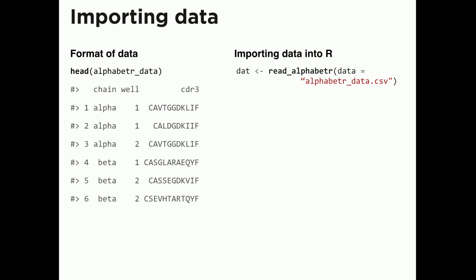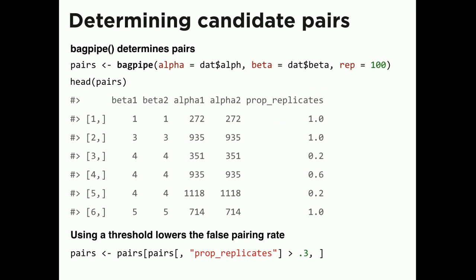Basically, the whole reason we have this complicated subsampling procedure is that it deals with the noise. When we tried to just do one pass through all the wells, a lot of those sequencing errors would be included in the pairing. So that's why we came up with this convoluted resampling procedure. By design, it minimizes the number of times spurious sequences actually get paired.